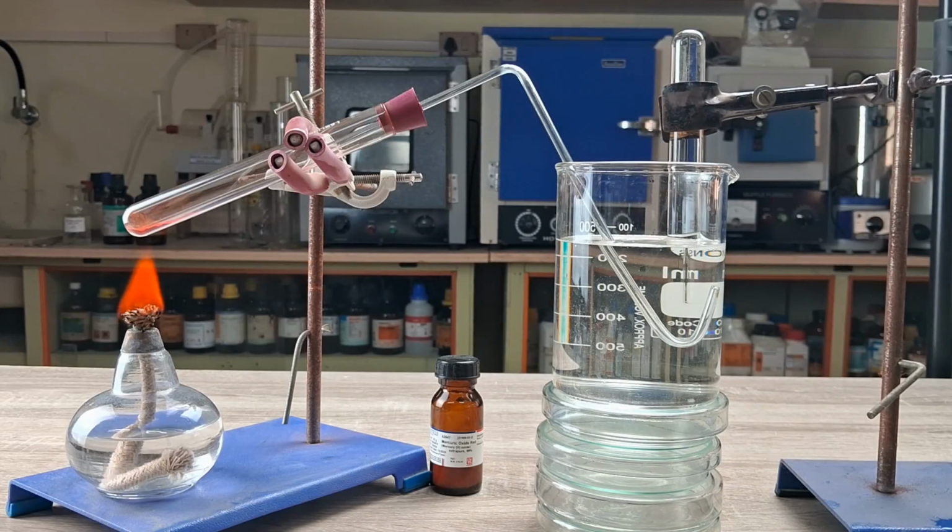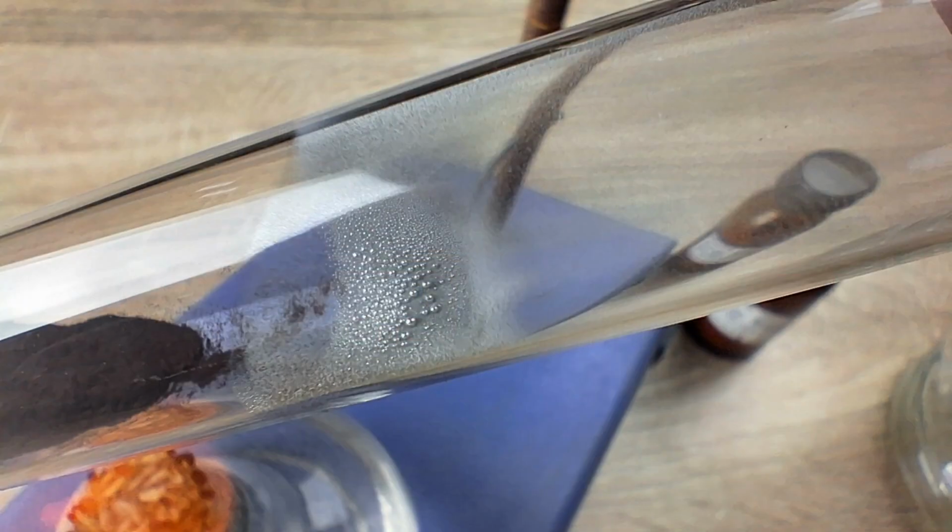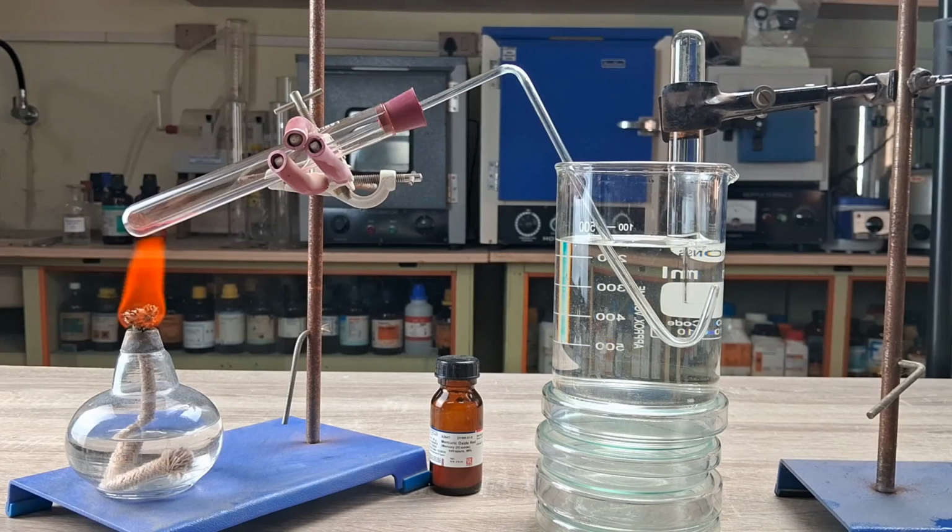In the chemical decomposition of mercuric oxide, when a small amount of the brick red colored compound is heated in a test tube, it gradually turns black and beautiful silver-like droplets of liquid mercury begin to coat the inner walls of the test tube, while oxygen gas is released as the reaction progresses.